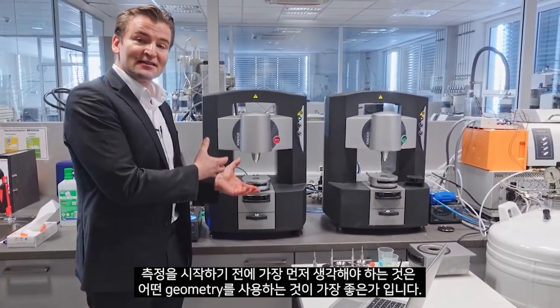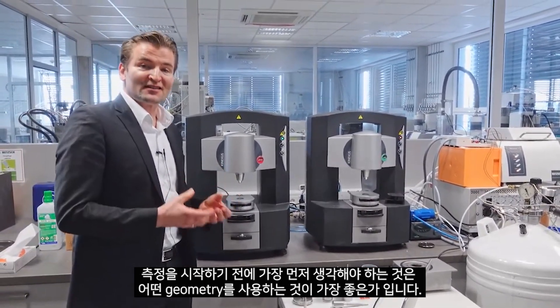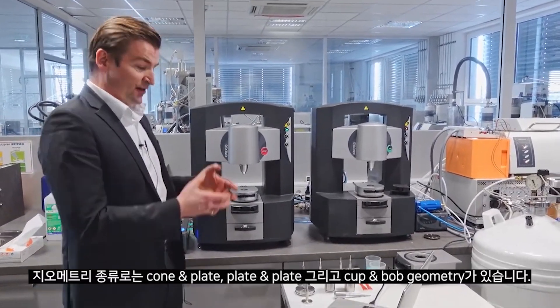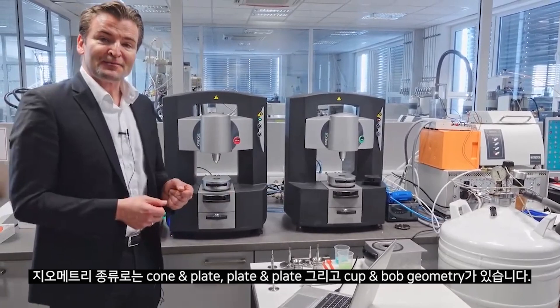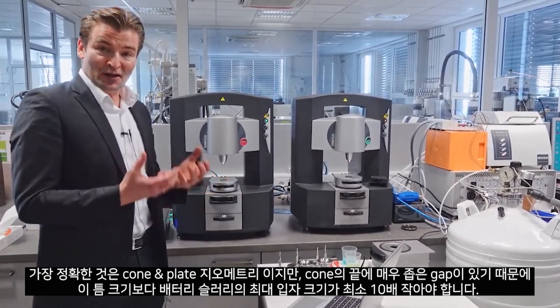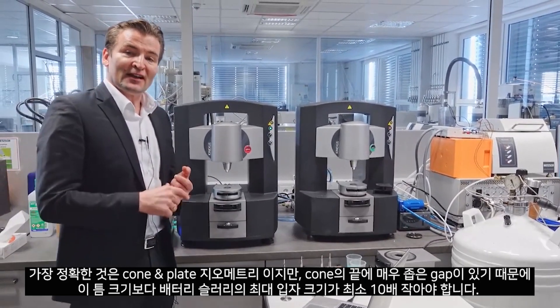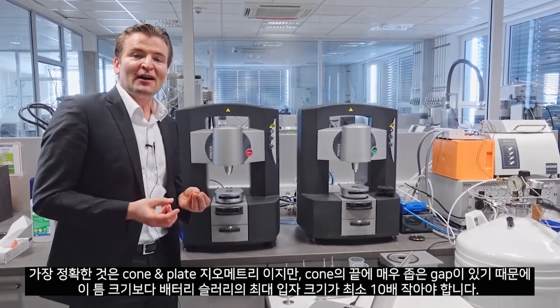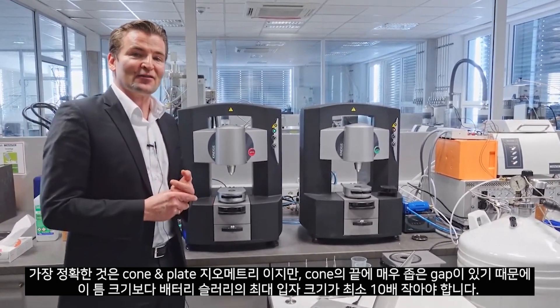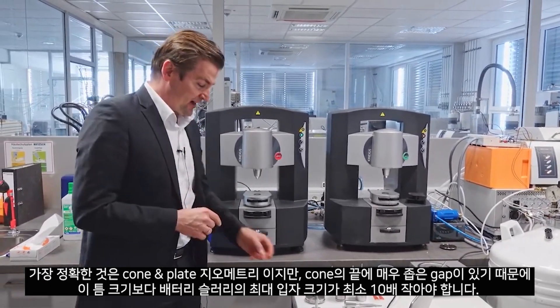The first thing you need to answer before you start a measurement is which geometry is the best to use. We have cone plate, plate plate, and cup and bob geometries. The most accurate is the cone plate geometry, but it has a very tiny narrow gap at the front of this cone, so our maximum particle size of the battery slurry should be at least 10 times smaller than the gap size of the cone.